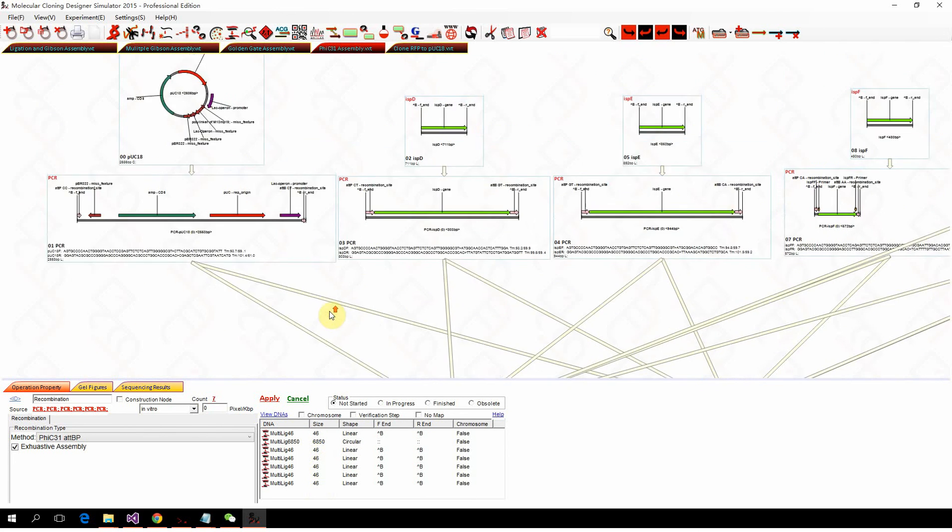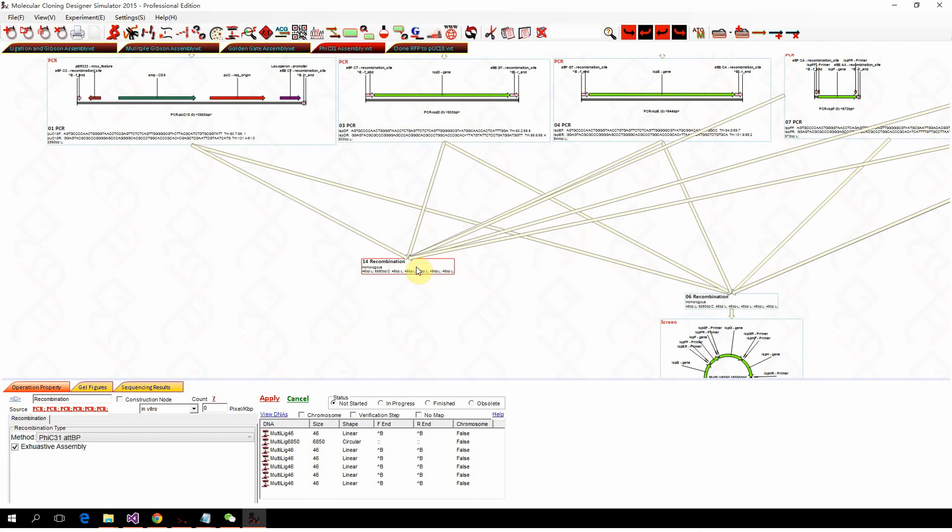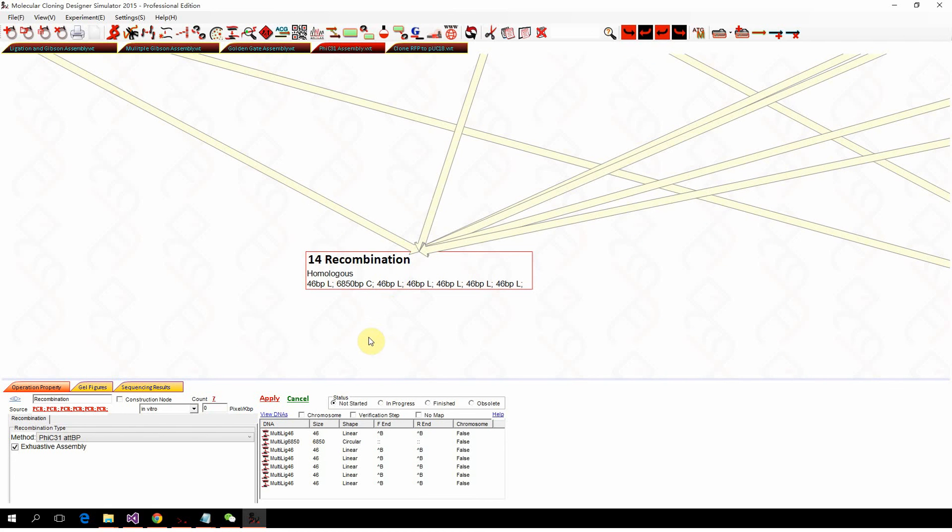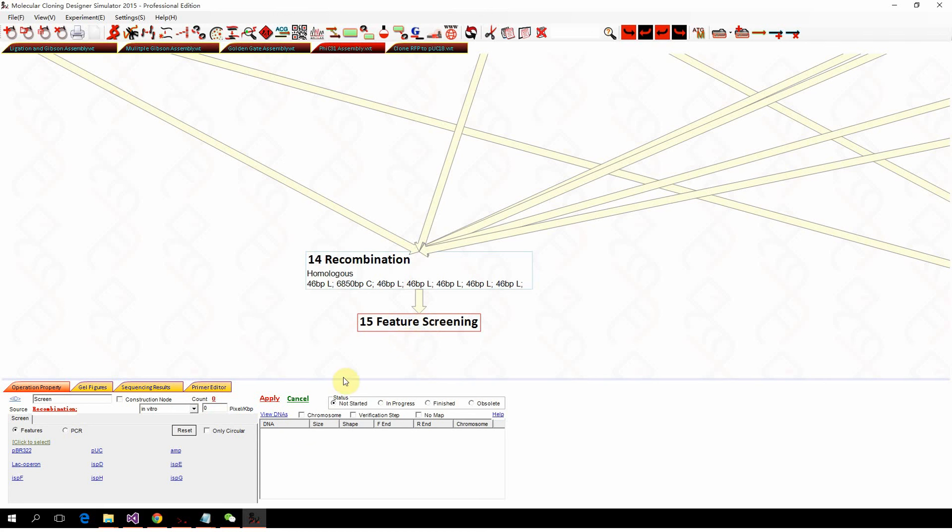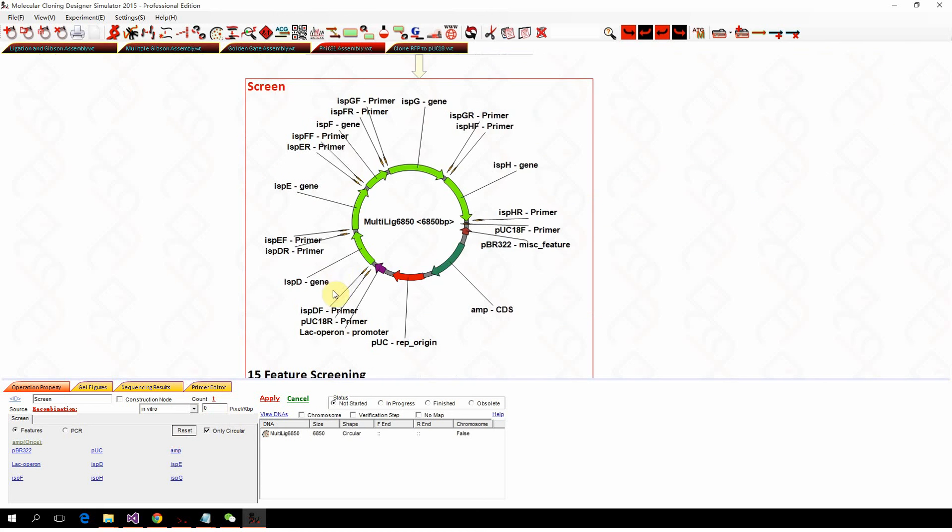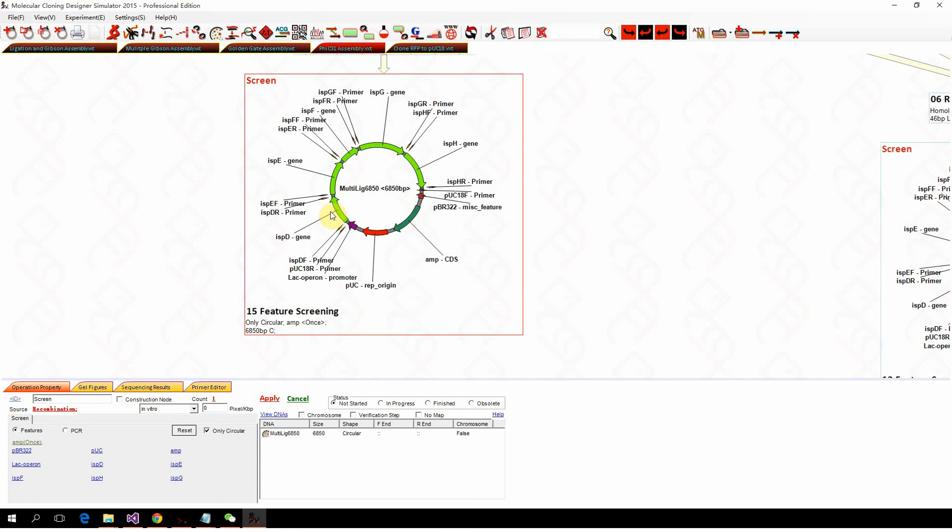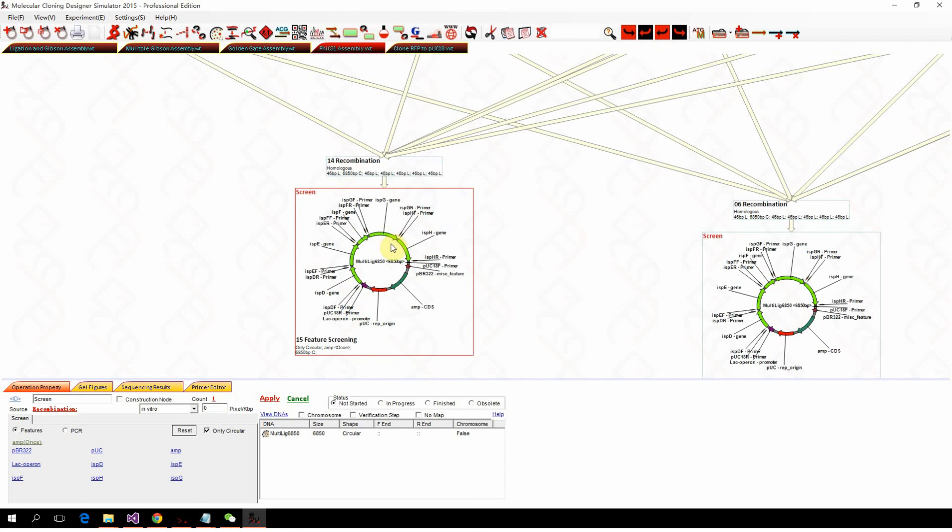But that doesn't matter. We just use the screen, and we want the circular one with the ampicillin, and we got the plasmid that has all five fragments assembled into the plasmid.